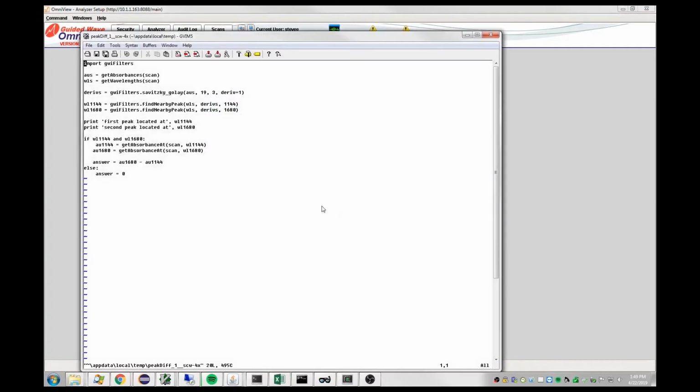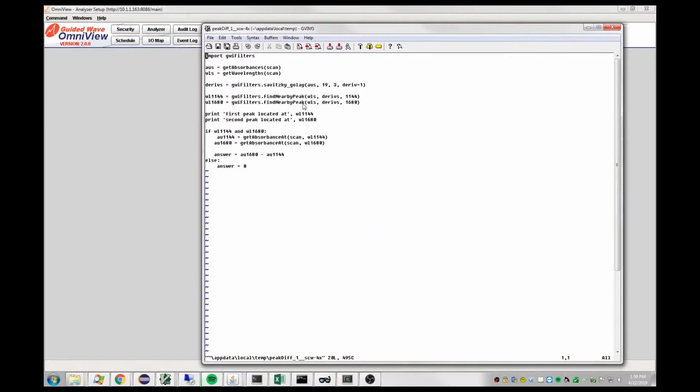I say yes. It opens the editor back up. I go to line 16. That's this line here. Note that Python uses the amount of indentation at the beginning of a line to determine the scope that that line belongs to. So basically it's telling me I indented 4 spaces here and only 3 here. That is an error in Python syntax. The indentation at the beginning of the line is extremely important. So I'm going to move that line over 1.